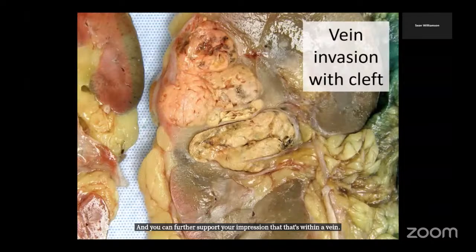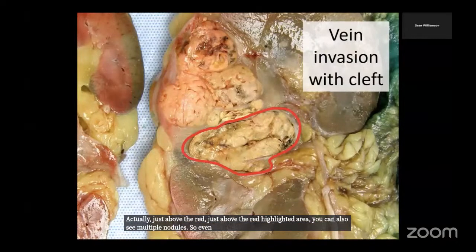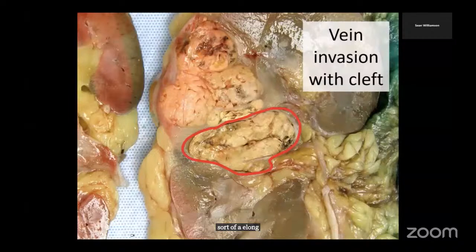Actually, just above the red highlighted area, you can also see multiple nodules. So even those areas may represent vein invasion. There's sort of an elongated nodule just above the red line, which to me probably also represents vein invasion.